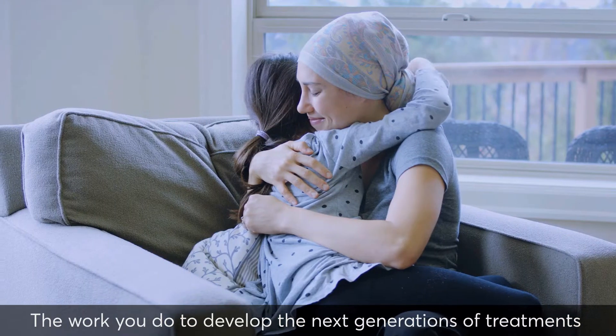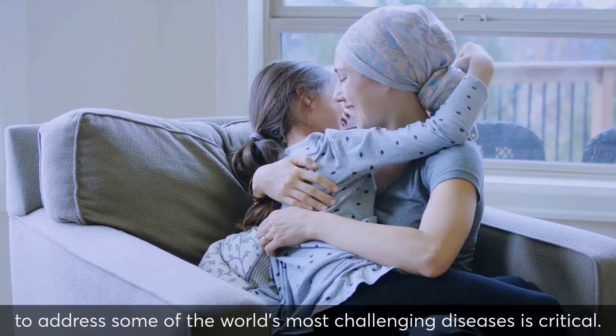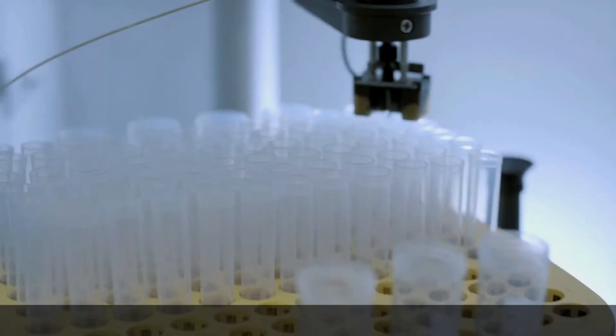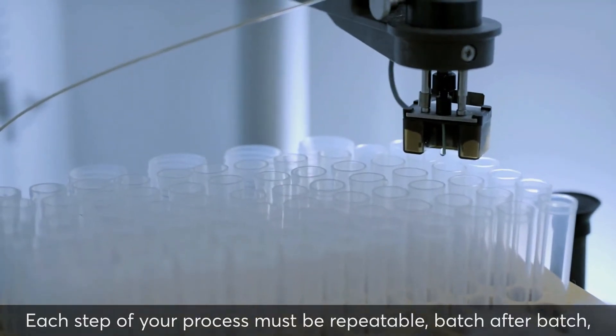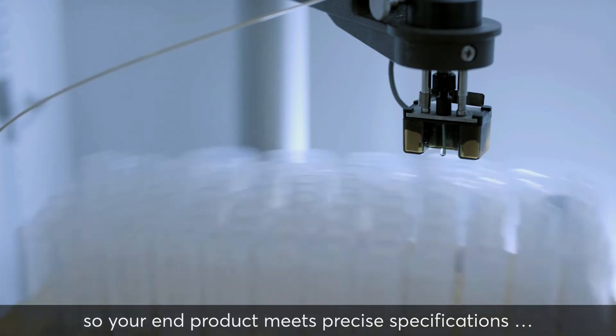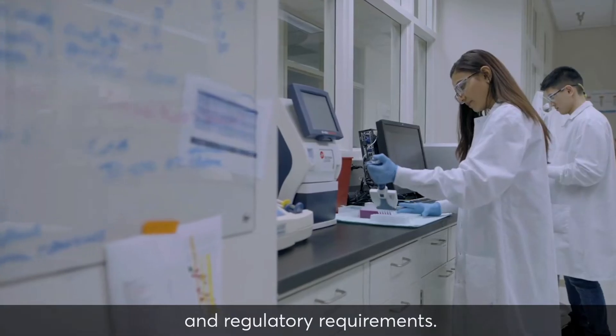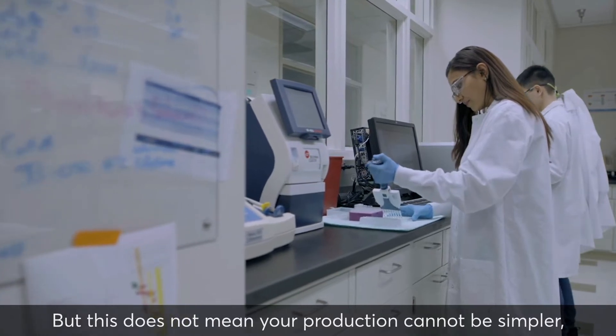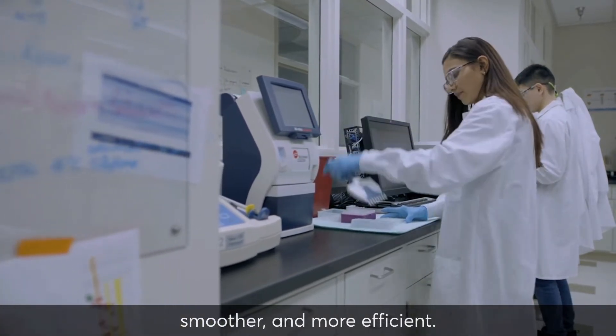The work you do to develop the next generations of treatments to address some of the world's most challenging diseases is critical. Each step of your process must be repeatable, batch after batch, so your end product meets precise specifications and regulatory requirements. But this does not mean your production cannot be simpler, smoother and more efficient.